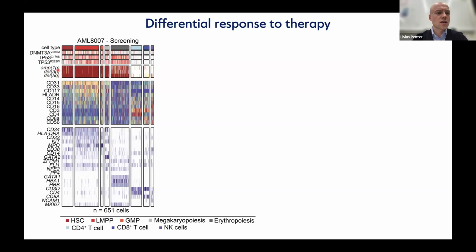We can see 3 chromosomal aberrations, and we can really see how we have a block of leukemic cells, and we can also see that they express the expected surface markers, and they also have the transcriptional profiles of leukemic cells. For example, they all express CD34. Then we also have the immune cell compartment that, of course, is absent of somatic mutations.